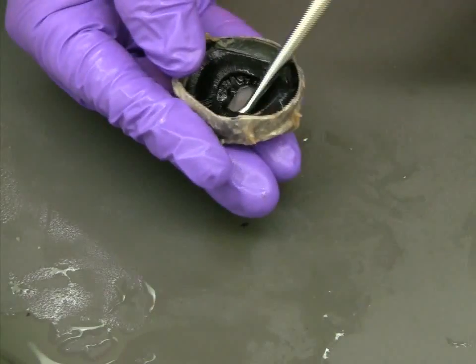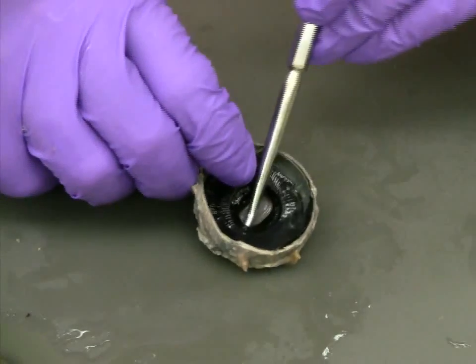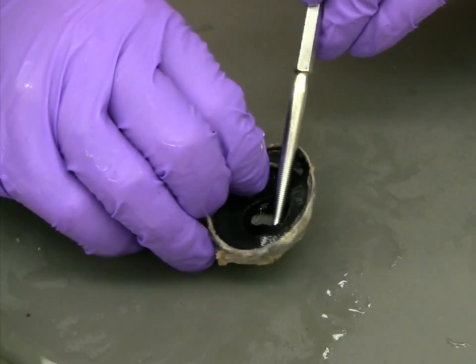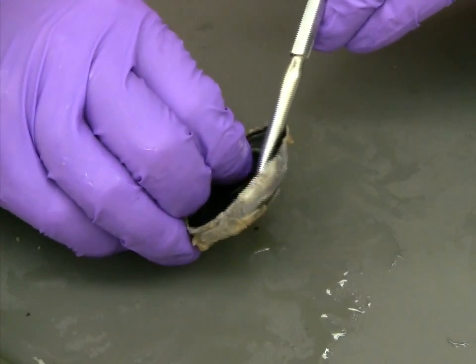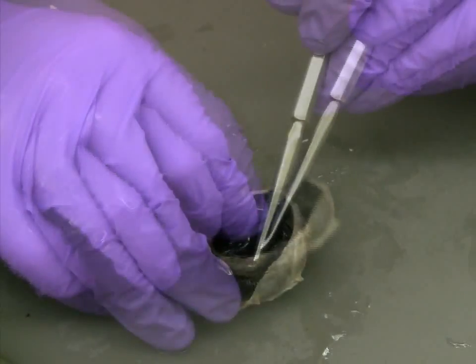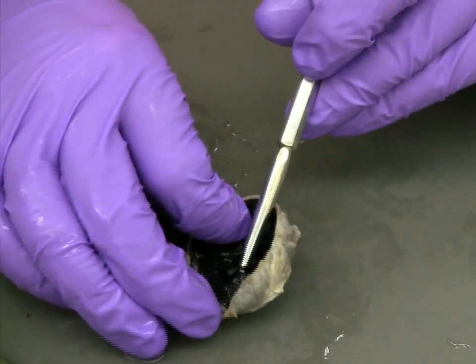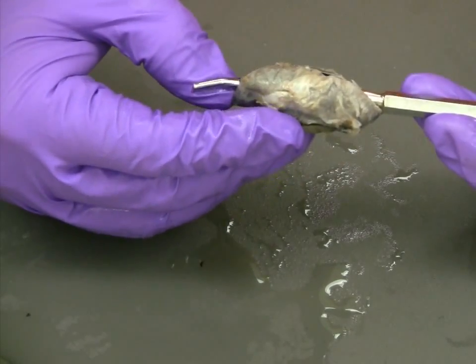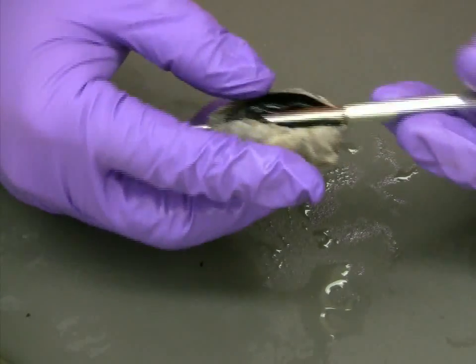In order to keep the iris intact, the best approach is to start in the center and work your way out with the blunt probe. Once you are able to get the probe completely under the iris, use it to slowly lift a portion of the iris away from the wall of the eye.